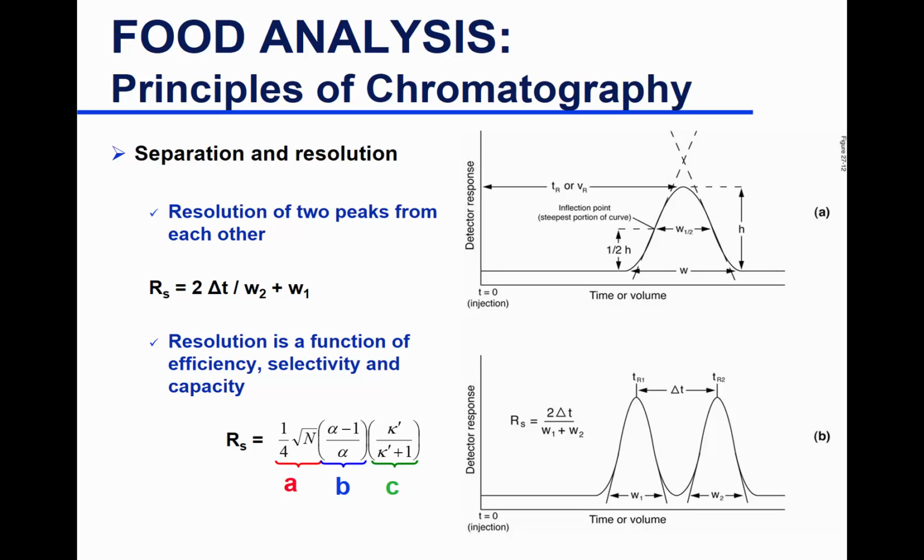So now that we understand some terms about retention, let's introduce more terms. The first term I want to introduce is the width. The peak has a height and it has a width. Sometimes you have the total height, other times there's the midpoint in height and the midpoint in width, because they can be integrated into the equation.